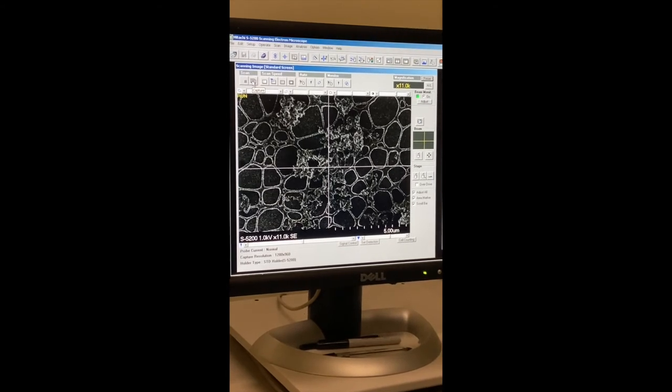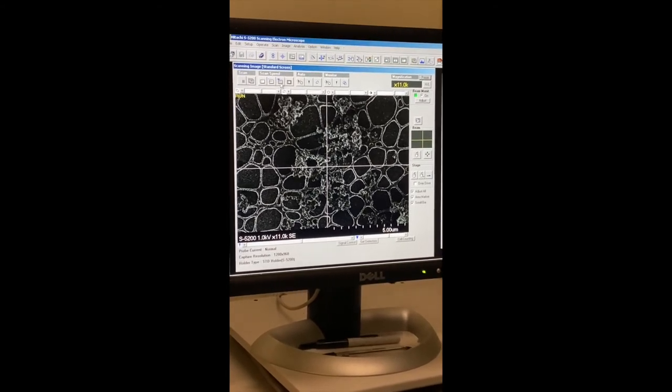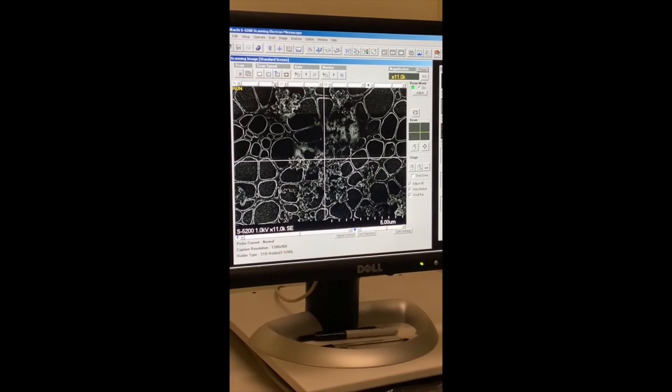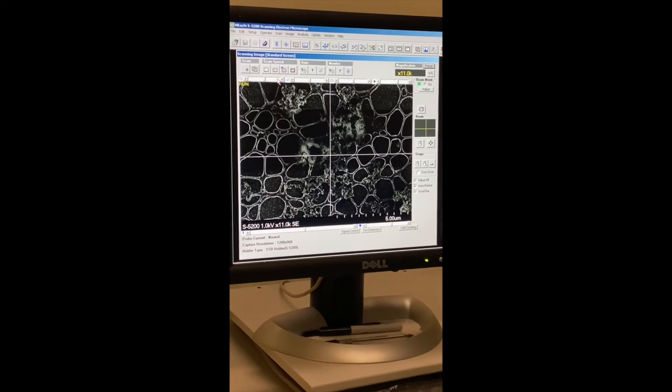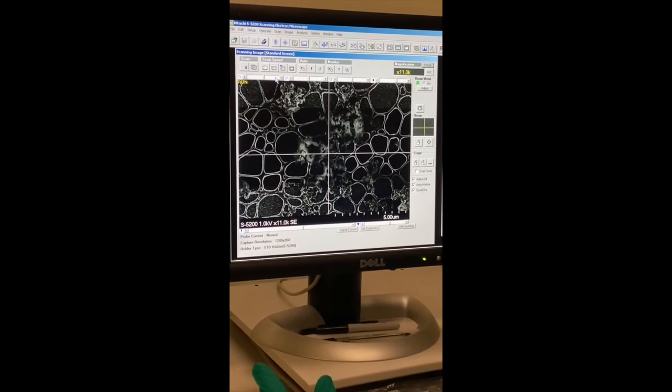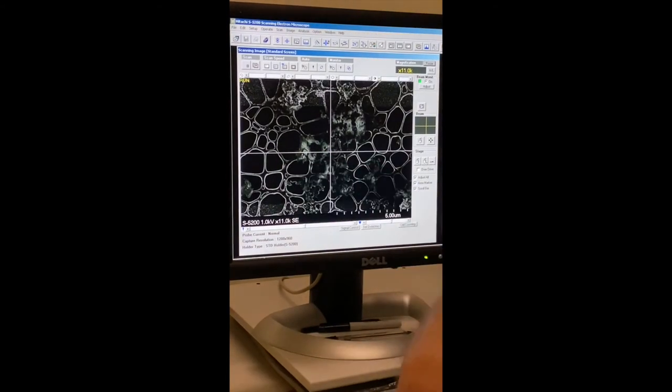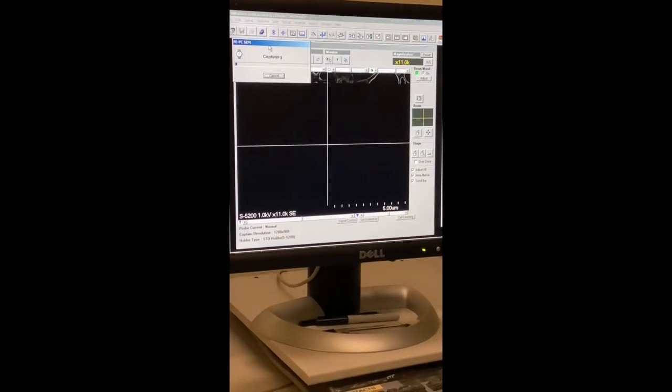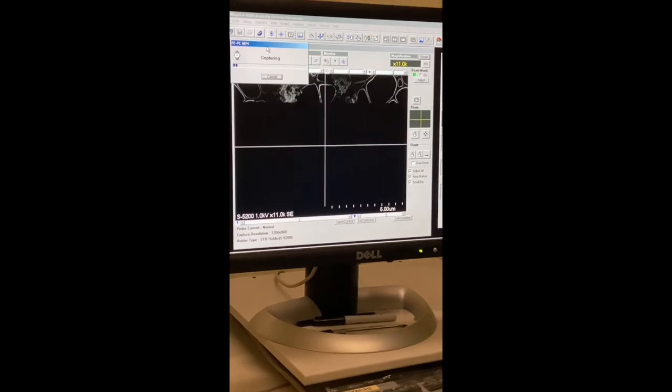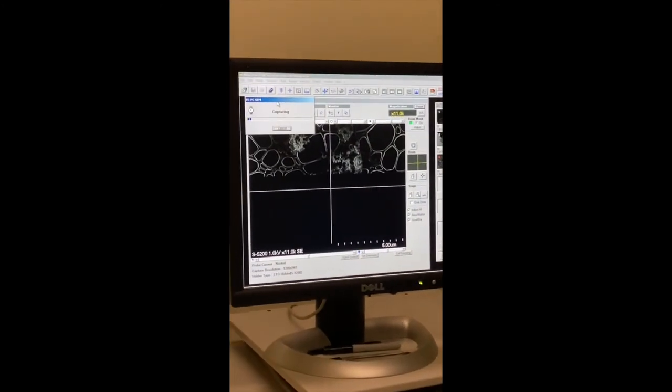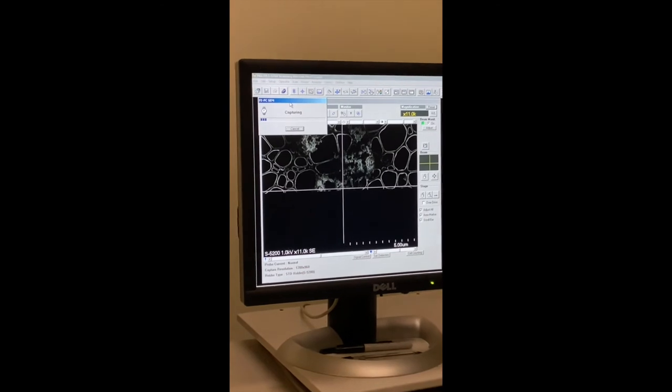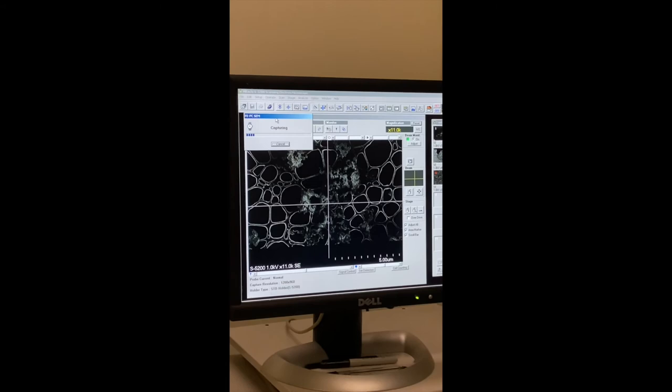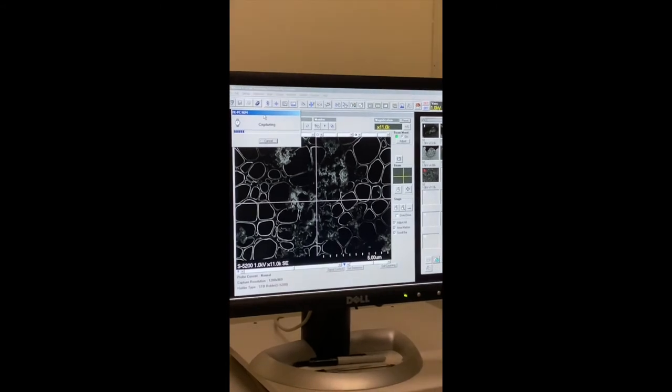In order to prevent charging in a non-conducting sample, we apply a thin coating of gold or conductive carbon to our material. This process is called sputtering, and it's very common on larger samples, those that have interesting features on the order of microns rather than nano. This is because that thin layer that we sputter on is often in that 10 nanometer size regime. So if your sample features are smaller than that or even a little bit bigger, they will get diluted by this thin layer of gold that you put over your sample.